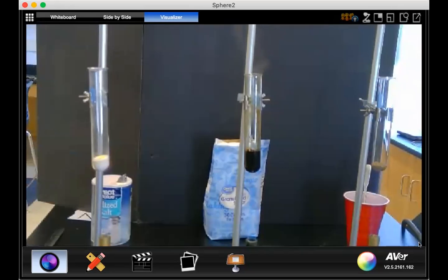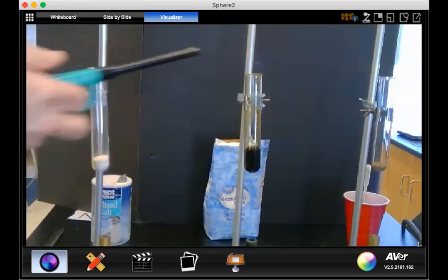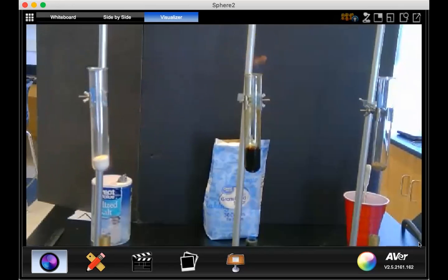Sugar, we got a nice little bubbling black cauldron in there. Now I got the flame coming, burning right off from the top of it. And that actually, while it looks kind of scary, does help with, as I mentioned, the odor in the room, if you will.